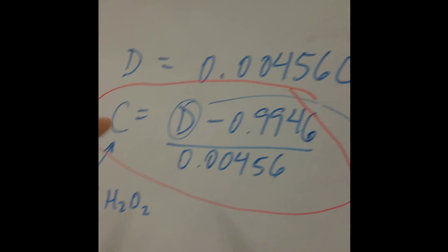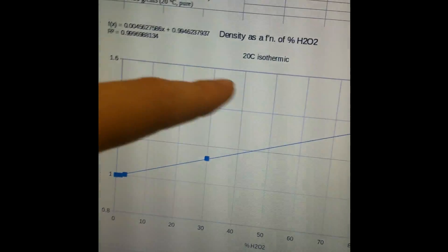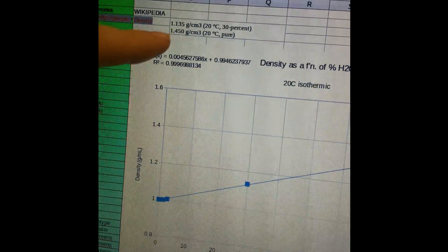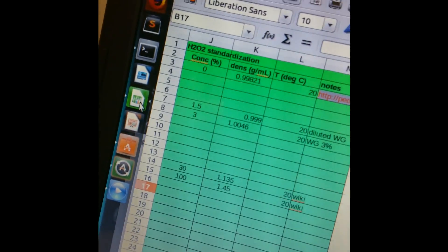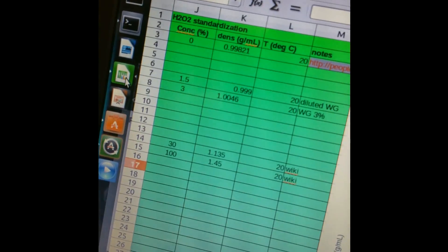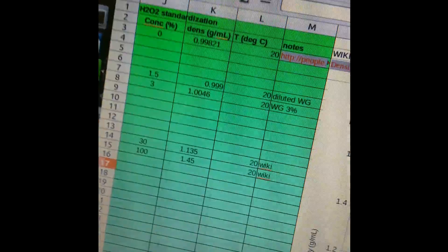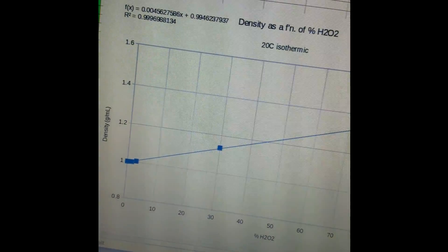Density is the only independent variable, and you need to report it in grams per milliliter. The way I derived this is a standard calibration plot using known densities at the same temperature — same temperature is important because density changes with temperature. I used 20 degrees Celsius as a standard. I looked up on Wikipedia that 30 percent peroxide is 1.135 g/mL, used pure water as zero percent, and added a couple of my own standards made from the three percent solution, including a half-dilution, to add more data points.